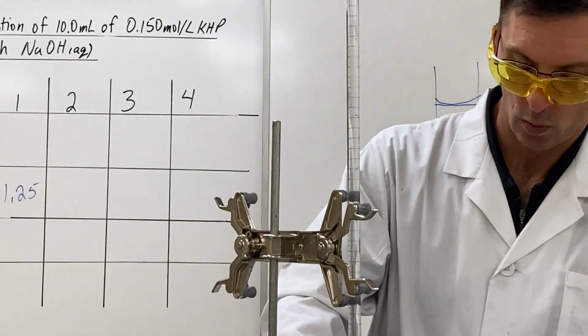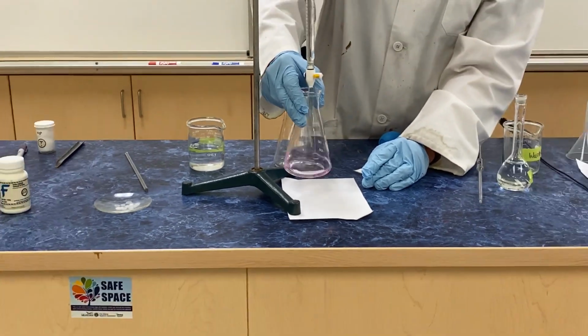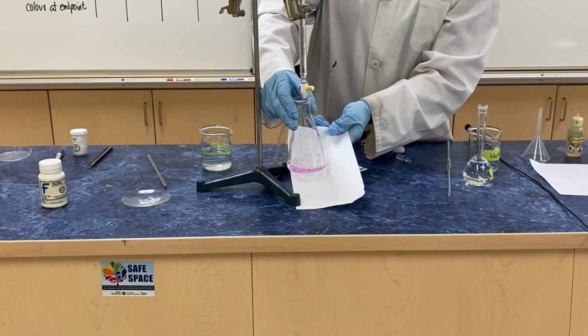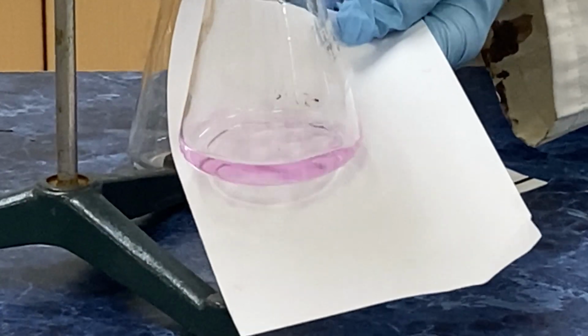Oh, I missed it. Okay, whoops. Sorry, guys. The magic happened when I was zoomed in on the wrong thing. All right, that's a nice endpoint. Give me a close-up of this end. It's a little bit too far. I'd say it's a little on the pink side, yeah.